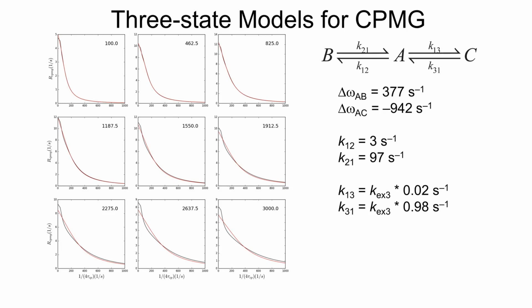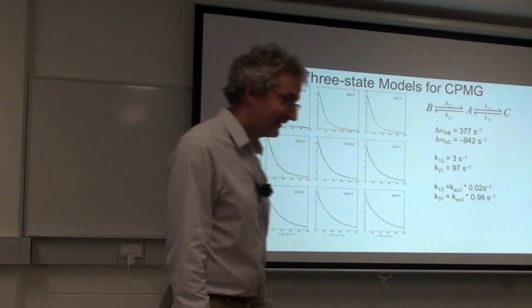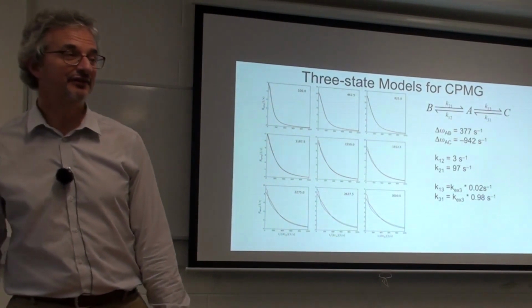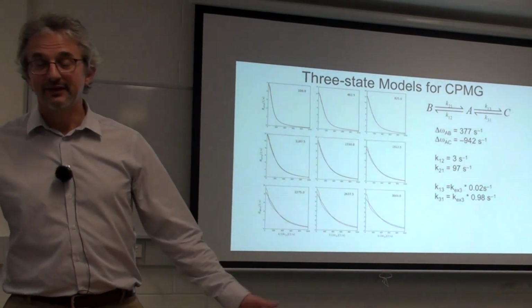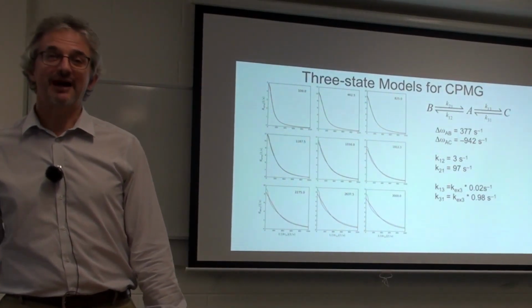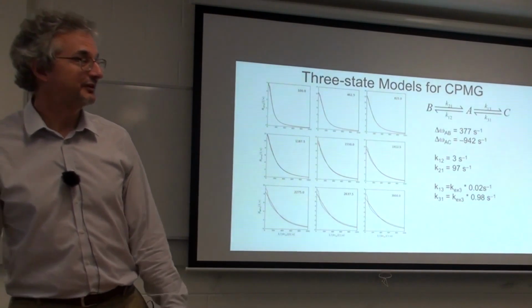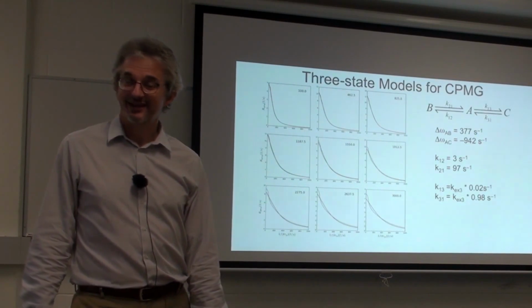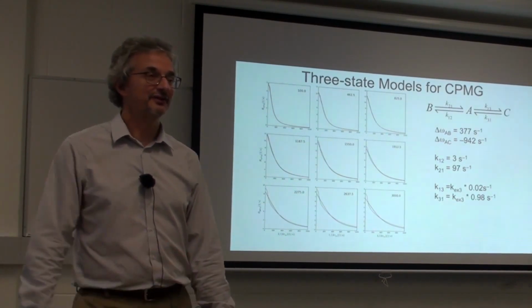You could simply be in a region of parameter space where the 3-state behavior doesn't deviate very much from some effective 2-state-like behavior. And typically then it's useful, if one can afford the experimental time, to try to change parameters of the system. If data is recorded at a different temperature, if there are 2 jump processes and they have different temperature dependencies, then one might start to separate those processes at one temperature compared to a different temperature.